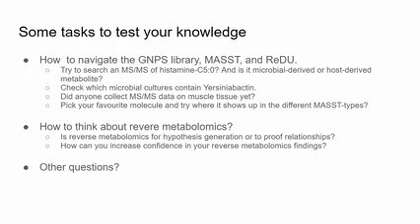If you bypass the first step, if you provide histamine in the media, then we reveal that a lot of the gut microbes can actually conjugate the histamine to C5. The only reason you don't see it is probably that one microbe decarboxylates histidine to histamine, and then a second microbe clicks or conjugates the histamine to C5. We detect this molecule only when we cultivate microbes in a community. If you have 10, 20, 30 different microbes as a community, then we start detecting those specific molecules.